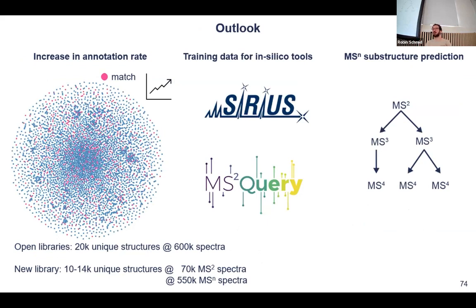Because right now, we don't really know where the spectra come from. So on GNPS, there might be some spectra that are still profile mode, or where the metadata does not match up. A lot of things happen because we made it very easy, because otherwise, it's not that people don't want to share, but it needs to be easy and comprehensible, because you shouldn't need a PhD degree to just push data somewhere, right? So really, we hope that this makes it very easy.